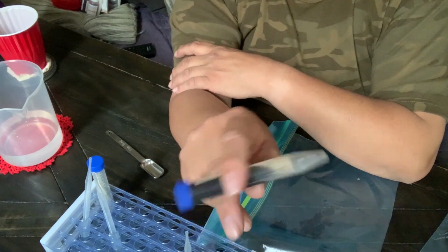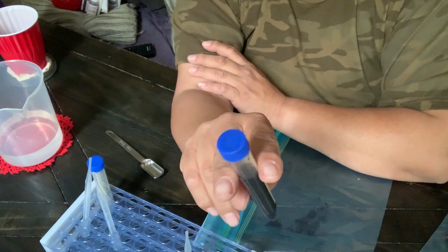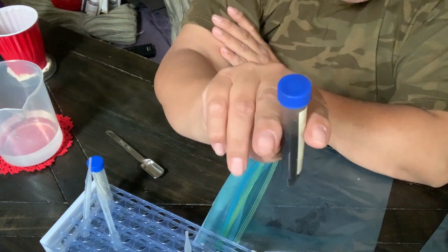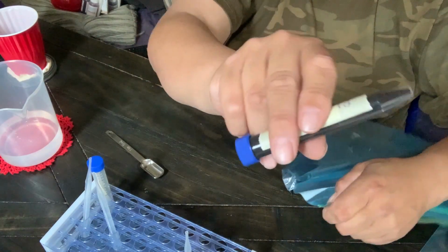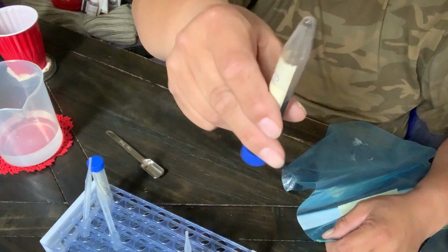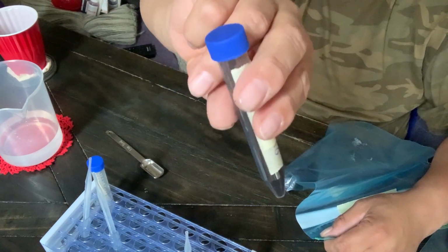So if you see anybody doing a violent shake, you know they don't know what they're doing, because you're just destroying the microbes. It's a gentle roll. All right, so this one should be the compost. And then, like I said, we're going to do this again when we put it in the slide. All right, it's almost there.